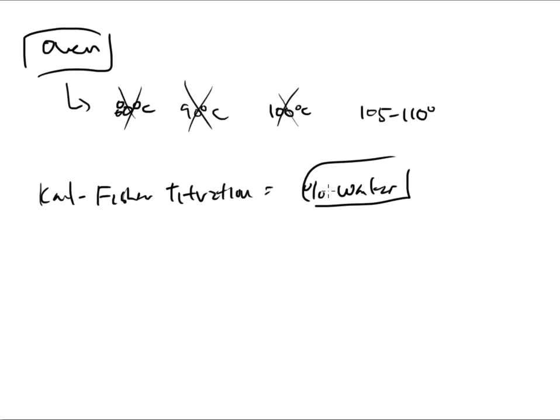Again, we're not doing that today. We can talk about this on a different day, but once more, this is an idea that there's more than one way to do something. Right? There's more than one way to solve an answer to a math problem, and there's more than one way to do a test in a lab. It really just depends on what you have at your disposal that you can use. So today, what you'll be doing is that you will be taking multiple samples, probably 4 or 5 samples, and you will be getting masses of each one of these.